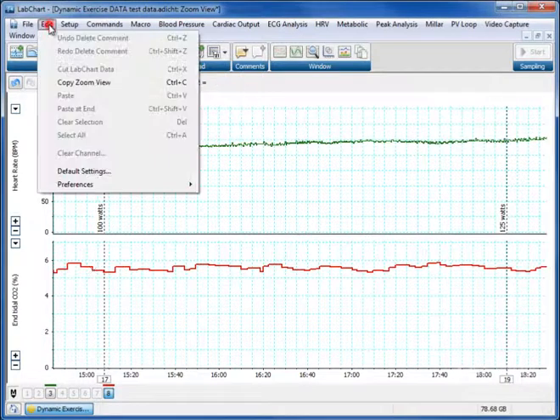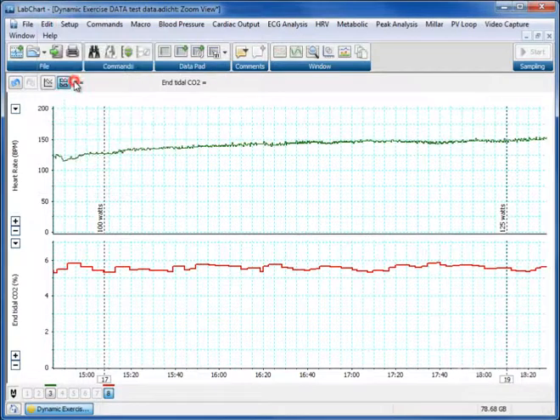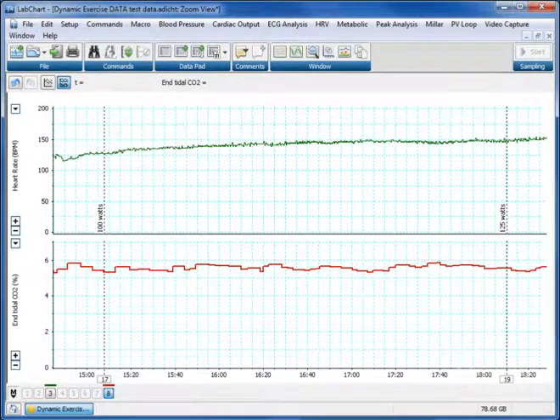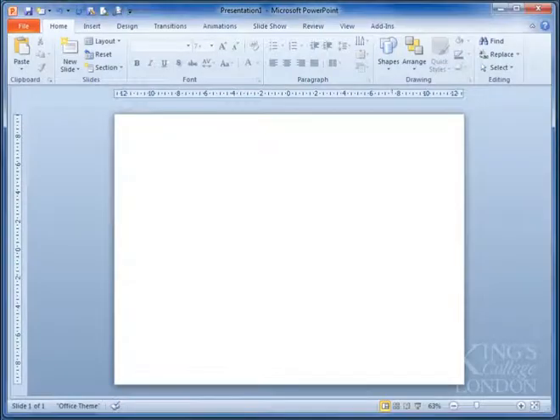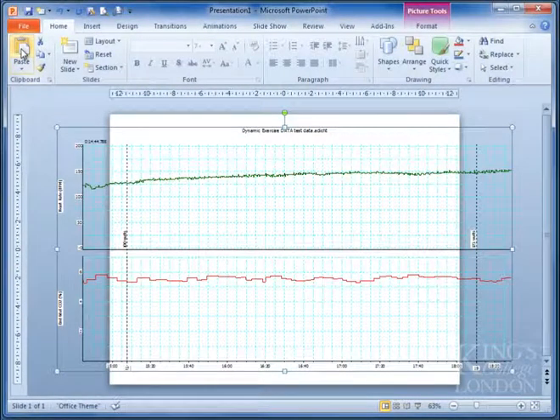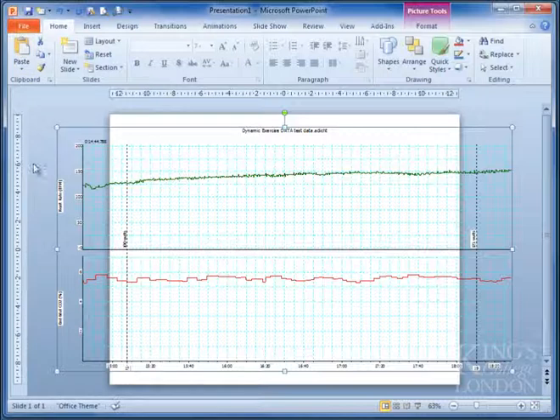So we're going to go edit, copy zoom view, and then we're going to switch to PowerPoint. And here's PowerPoint running in the background, and we just click on the paste button or press control V. It pastes our data onto the screen very nicely here.